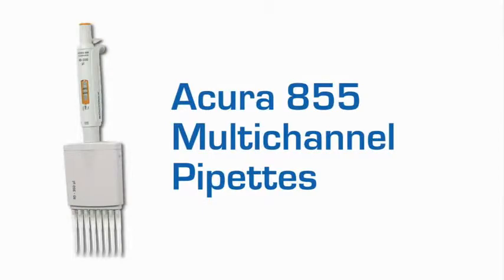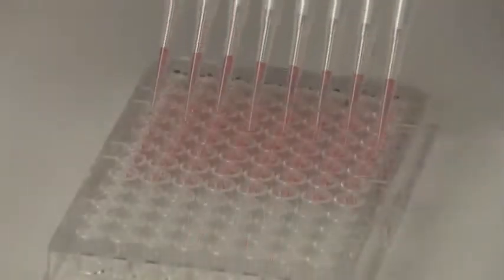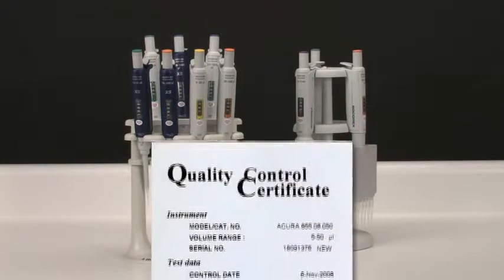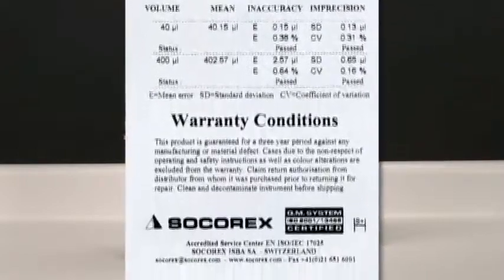The Acura manual 855 multi-channel models come in both 8 and 12 channel models to enable high-throughput pipetting with microplates. All Socorrex pipettes are engineered and crafted from the highest quality materials to ensure reliable, long-term, high-precision operation. They come with an individual QC certificate and an industry-exclusive 3-year warranty.